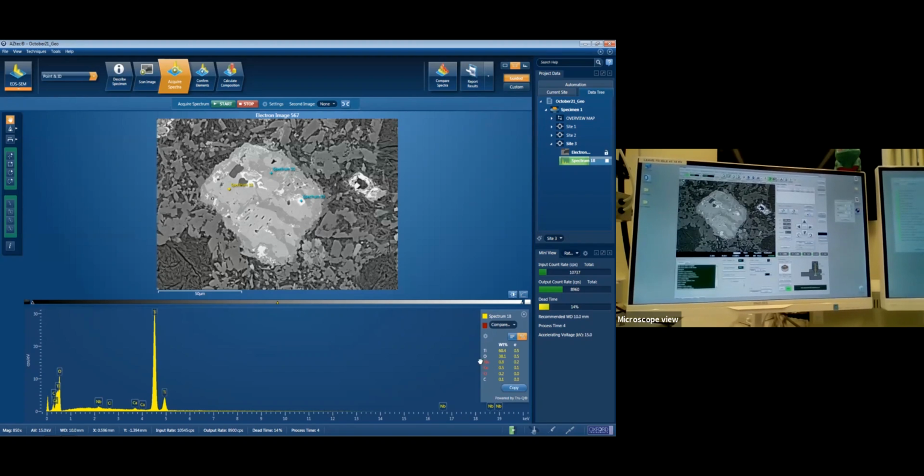And again, I'd be surprised if it is actually picking up niobium. Could be, but it's not confident about it. So that's something that we would take to a different machine to double check. But because we're personally not trying to mine niobium out of this, I wouldn't worry about it too much.